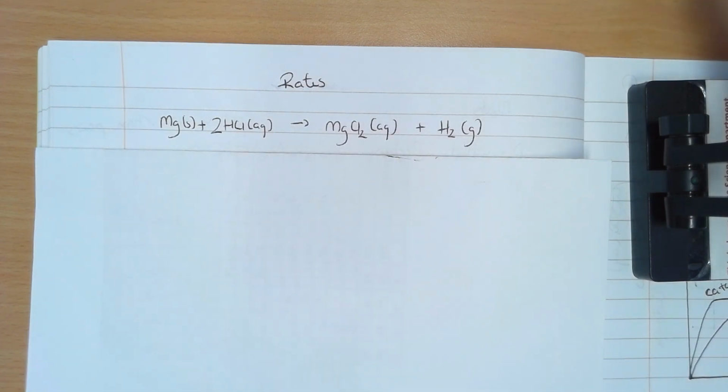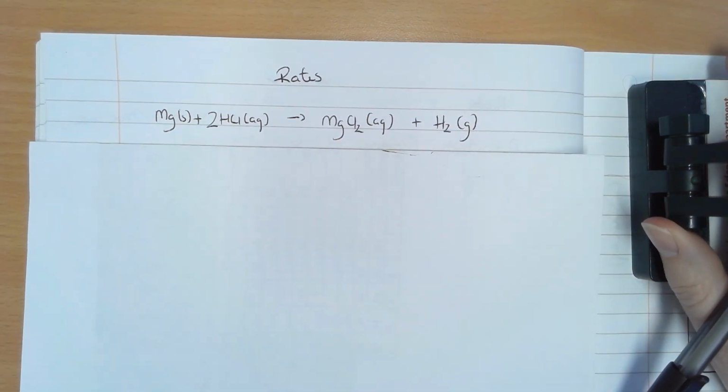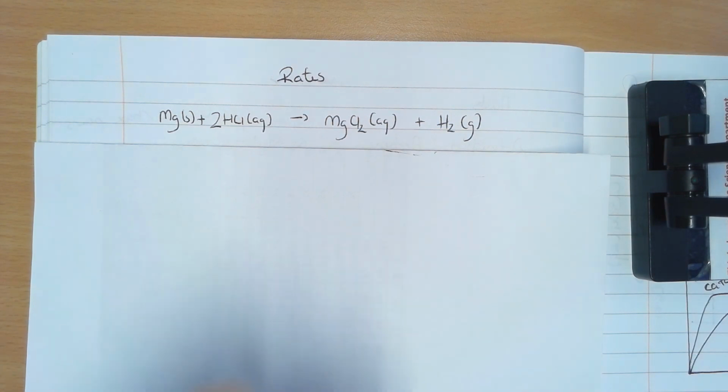Right, I'm going to go through two sets of core practicals in this video, rates and electrolysis, just because we've done them both relatively recently, so I think I can hopefully get them done nice and quickly. First one we'll do is rates of reaction.